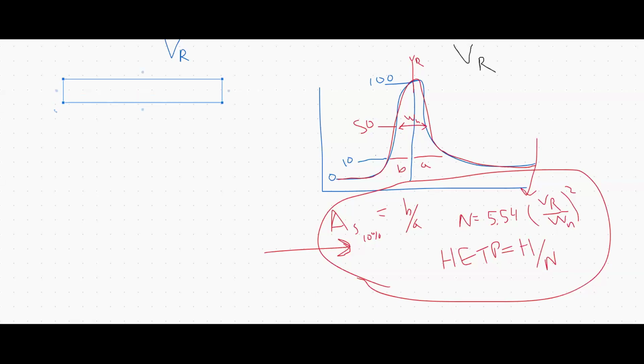I was packing and qualifying a BPG, a 2-liter BPG column, and I was using an ÄKTA pilot, and there was no sample loop, there was no injection method. I guess I could have used the B line really quick, but those valve changes on the old ÄKTA pilot, you may know, are kind of slow. I don't know how good of a job it would have done with the injection. So the phase transition analysis was used.